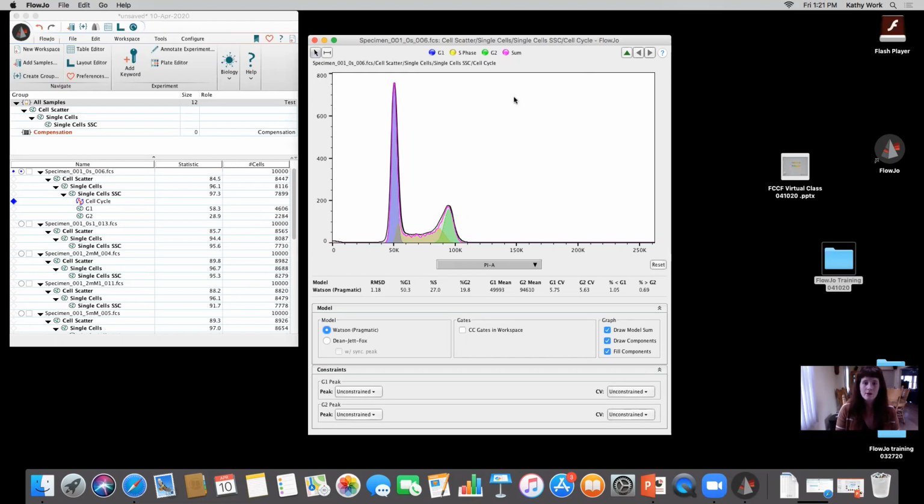Okay. So, like I was mentioning, we can make some adjustments as we're going along to try and fit these peaks a little bit better. One of the things you'll see in this plot is that I have the option to put in an interval gate to set a range. It's a minimum and maximum range to define inclusion or exclusion of a single dimension.